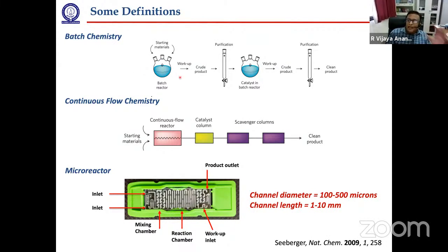Okay, and then after the reaction is over, you can closely monitor the reaction by using thin layer chromatography techniques. We call it TLC, and you can monitor the reaction very closely. Once the reaction is over, the TLC will tell us the progress of the reaction. Once the starting material is completely consumed, we stop the reaction, and now we need to take out our product from the solution. Suppose you use some inorganic reagents, you have to get rid of those inorganic reagents from the product. For that, we need to do workup.